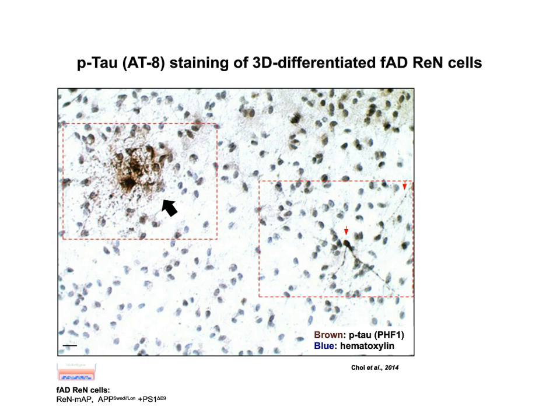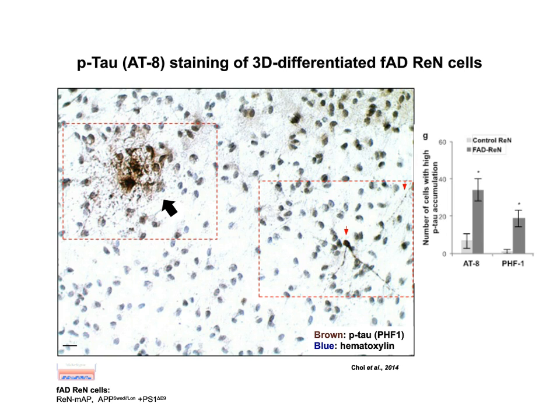And also we see the area which is highly enriched with this phospho-tau. And we think that the area may possibly be highly enriched with A-beta oligomers. And we did unbiased counting as expected. There is a robust increase of the hyperphosphorylated tau containing neurites and cell bodies in AD cells as compared to the control.